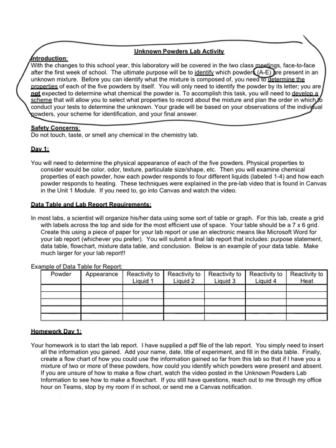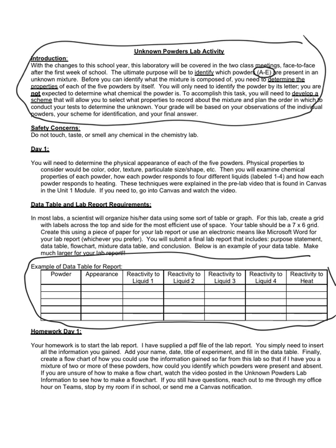And once you've got all that data, I have a template in the unknown powders lab, which you'll fill out for your lab report that you'll finally submit electronically. But this is what your data table will look like. It's a little bit bigger so that you have more room to write in it, but you can then see what you'll have filled out after day one.